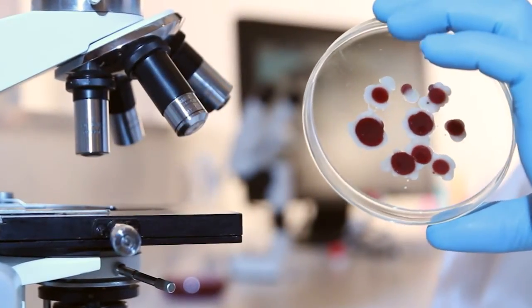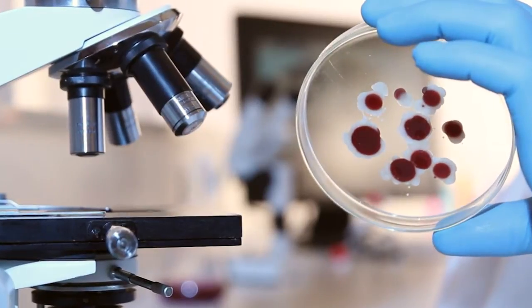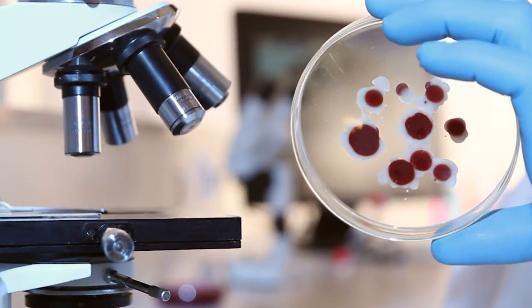Knowing the root cause of any microbiological contamination event is challenging if you don't know when it occurred.